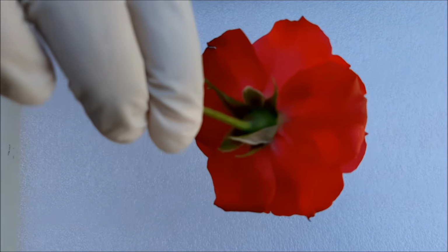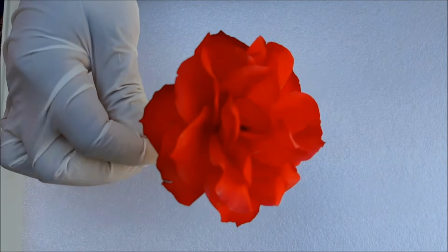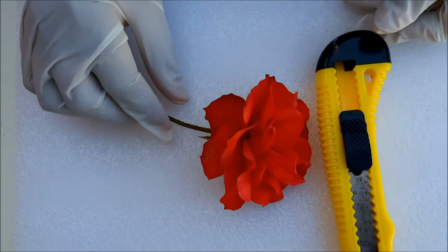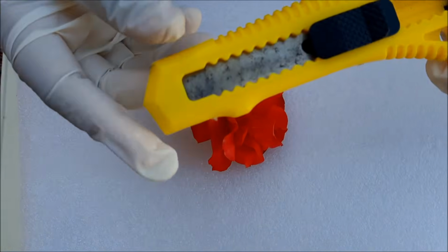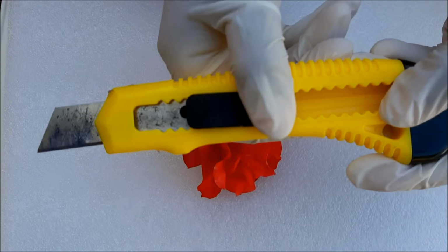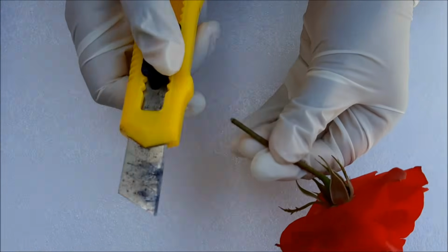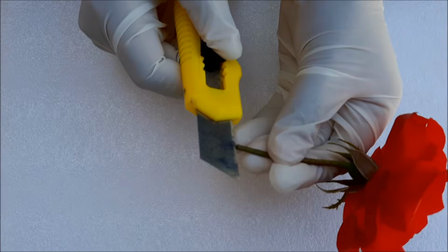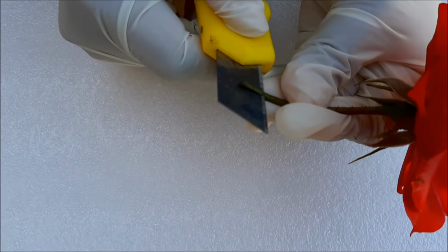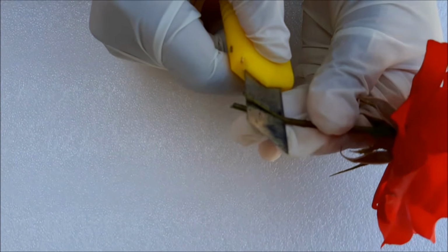You need to be very careful and have patience when doing this, so that you can get two perfect halves of the flower. The best tool to dissect a flower is a blade, like the one I'm using now. But remember, the blade is really sharp and you have to handle it with extreme care. If you cannot do it, please get it done by your parents or any adult, which is so much the better. I'm also wearing a pair of gloves to safeguard my fingers. So now, let's start dissecting the flower, carefully and patiently, in order to get two perfect halves.